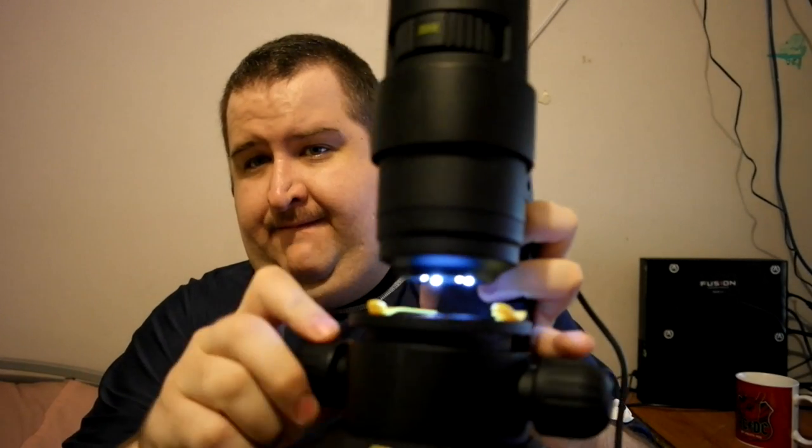The drawback on this is the magnification: it starts at 20, then goes to 80, then goes all the way up to 350 times magnification. So that's basically the magnification it's got built into it. It's also got a button on the top which you can turn the light on. It's got a light feature, which the other one did as well, and a little light on the bottom. It's just a lot easier to muck around with something like that because it's got the focus on everything. It's just so much easier to see things.